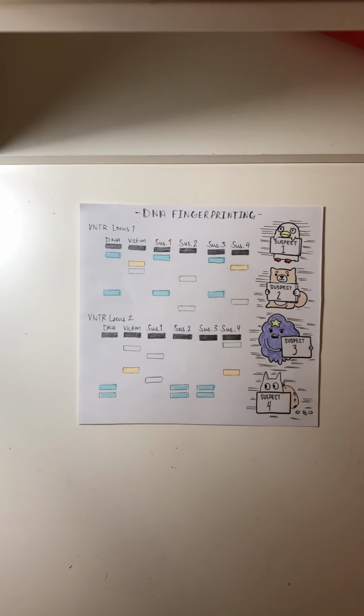And so today we'll be looking at how DNA can be used for forensic analysis, specifically how DNA fragments are amplified through PCR, or polymerase chain reaction, in order to create a DNA fingerprint. We'll be using this DNA fingerprint to identify a culprit using VNTR, or variable number tandem repeats, which are places on a genome that have repeating nucleotide sequences.